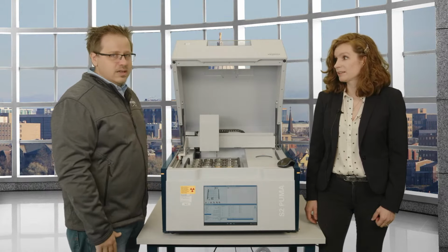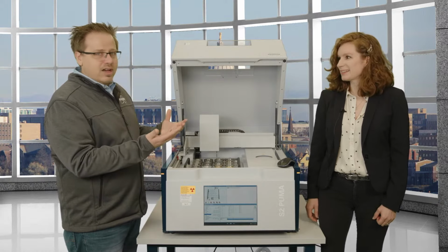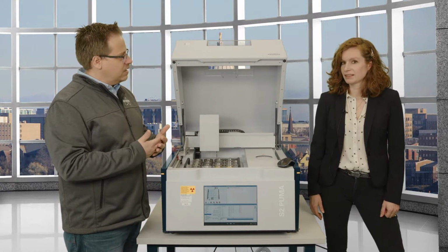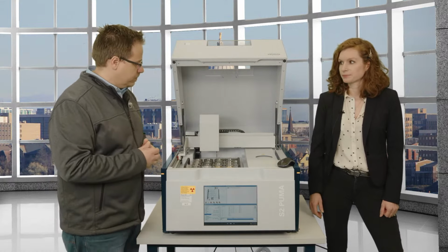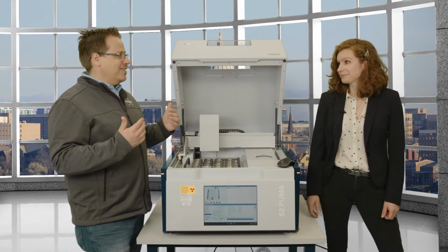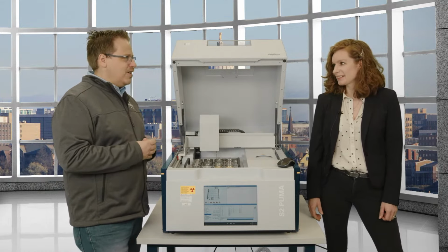Correct. Like you said, XRD is a little bit more my background. To me, that elemental information is so key to validating and oftentimes even getting a good search match, because you can exclude so much of the database. So, metals, like you said, they fluoresce like crazy. That's kind of easy, kind of the softball thing here.